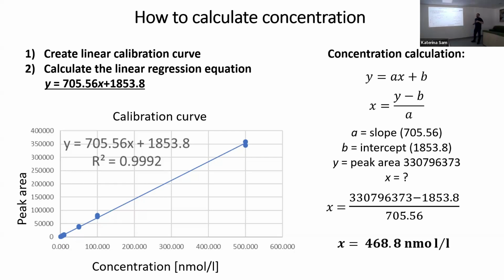It's very easy, but if you need the absolute quantitative information, you need the standards. It's impossible to measure the absolute quantity without the standards.